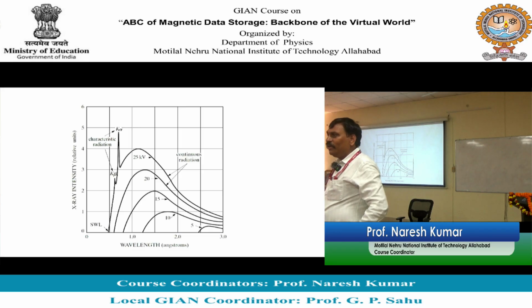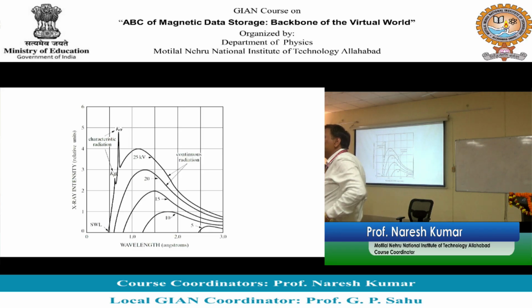है ना? और फिल्टर करने का तरीका क्या है? इसके आगे कुछ रख दीजिए, है ना? वो एब्जॉर्ब करेगा वो. या तो ये होगा कि सारा एक्सरे एब्जॉर्ब हो जाएगा, है ना? मैं इस तरह का फिल्टर चूज करता हूं कि only this much is suppressed and this small kink is left. छोटा kink बचता है. And this kink has a wavelength of what? Let's say here it is 0.6 angstrom. So now for me that small kink that has one wavelength is important.